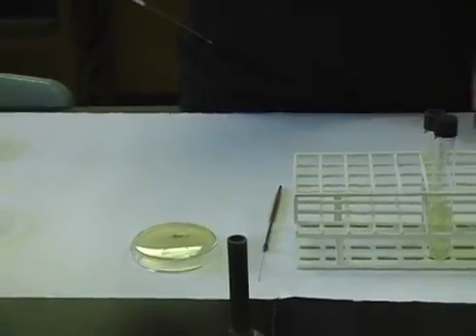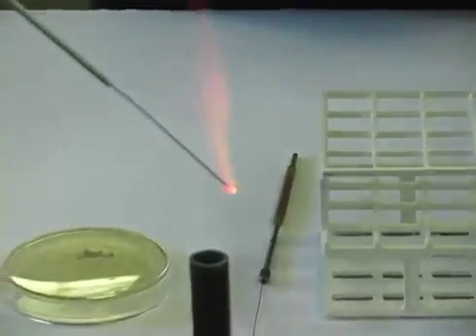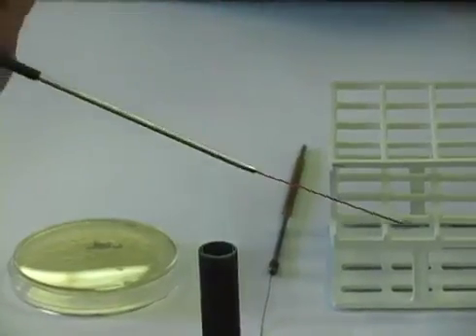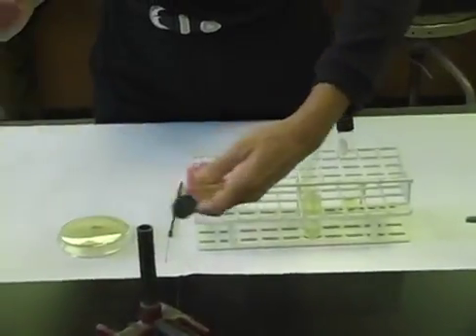Transferring our microbes to an agar plate, we'll use a technique called streaking. I'm going to use my inoculating loop. This is my original microbial culture.